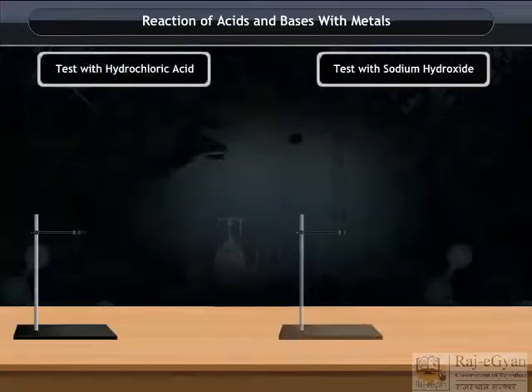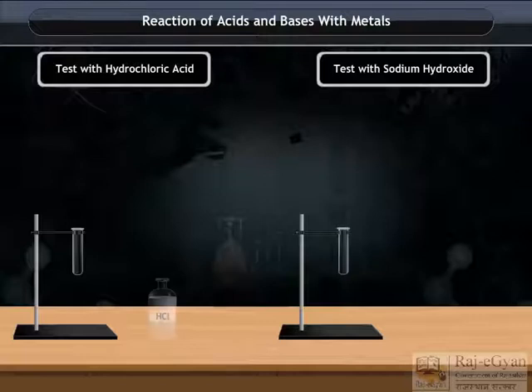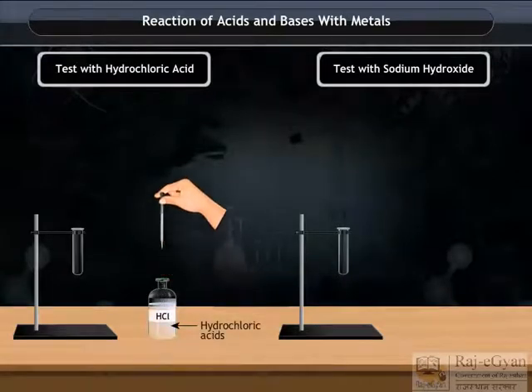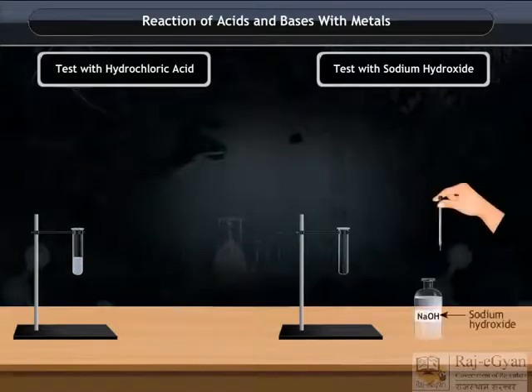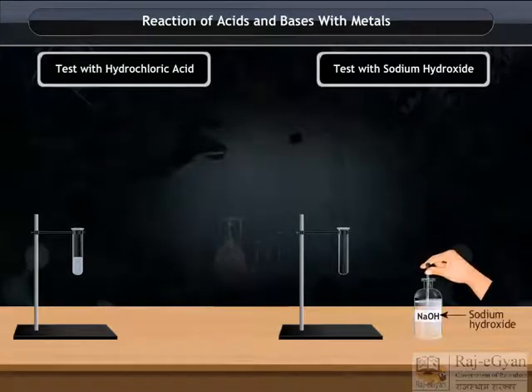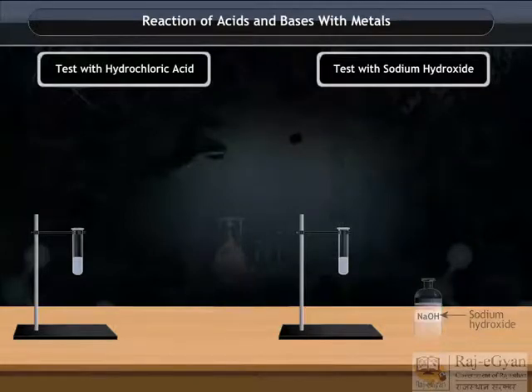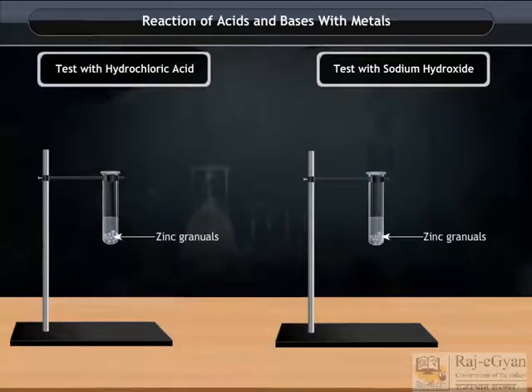Reaction of acids and bases with metals. Set up the apparatus. Add 5 ml of dilute hydrochloric acid and sodium hydroxide respectively. Then add a few pieces of zinc granules to both the test tubes.